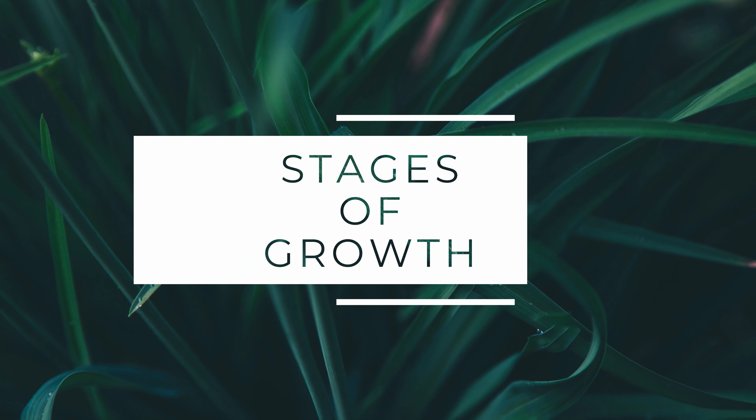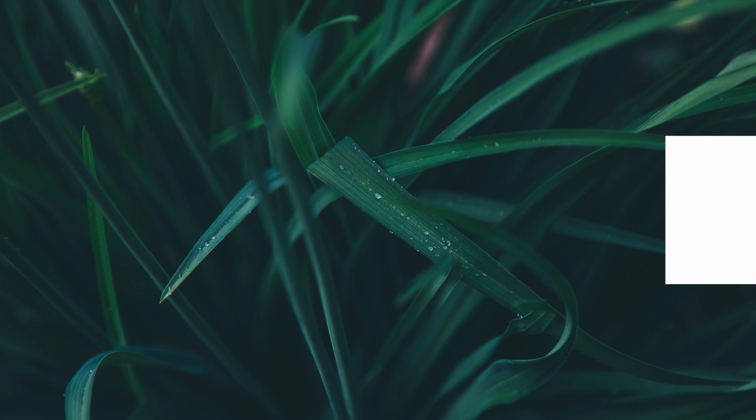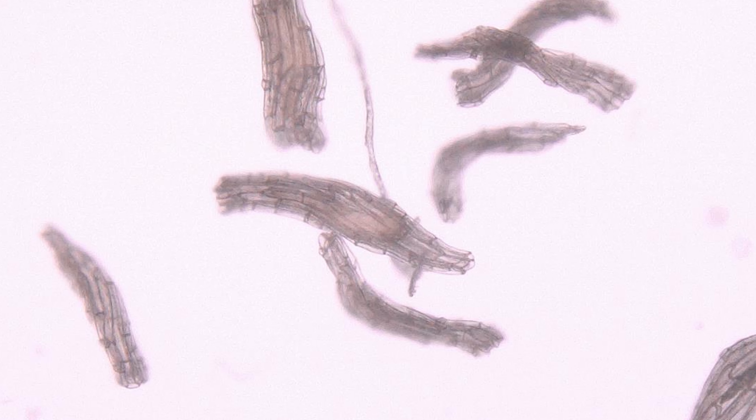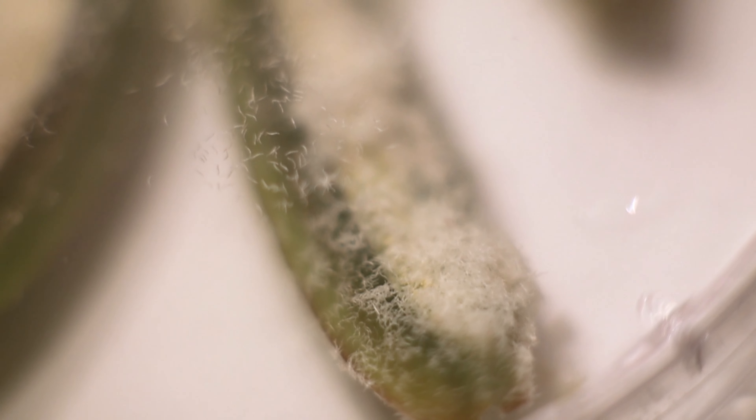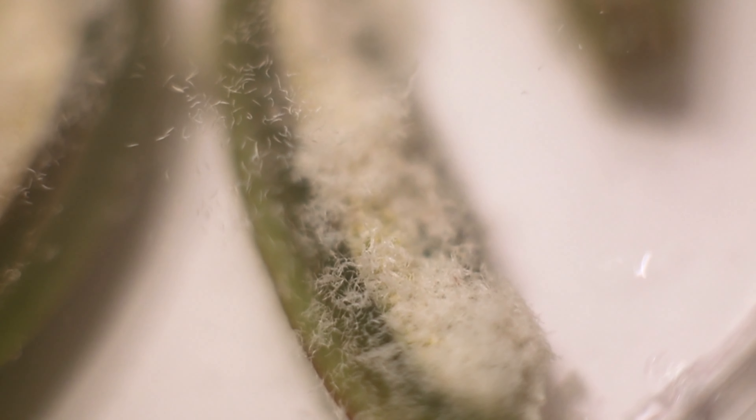Orchid seeds are quite different from most ornamental plants that you may come across. They don't have an endosperm, and if you look very carefully under the microscope, the seed basically looks like an embryo with a mesh cage wrapped around it. It doesn't have a nutrient pack, so it relies on mycorrhizal fungi for it to develop and form.